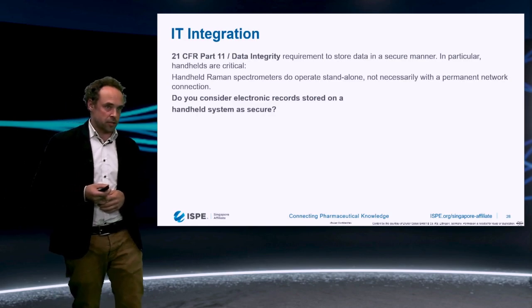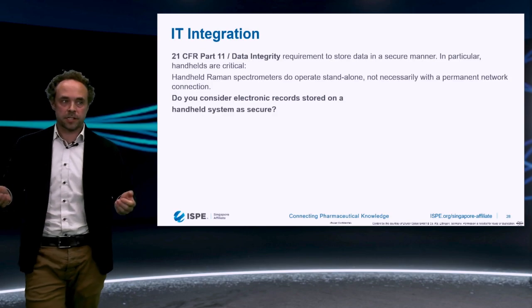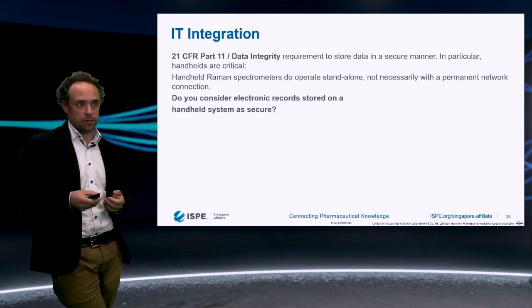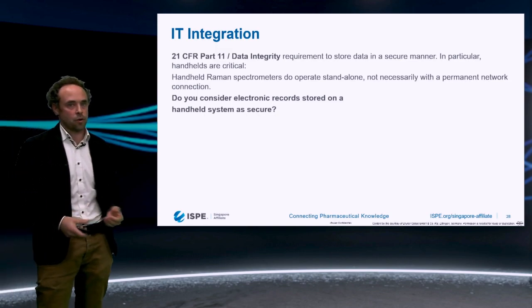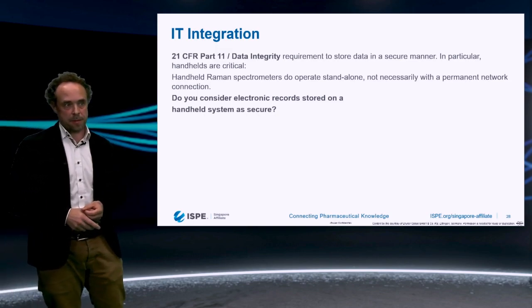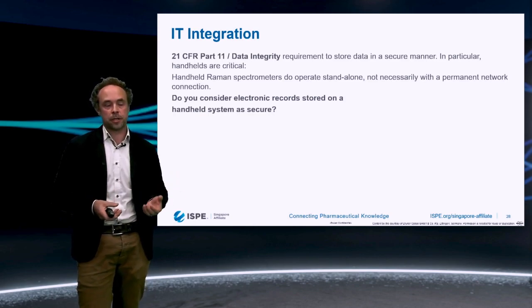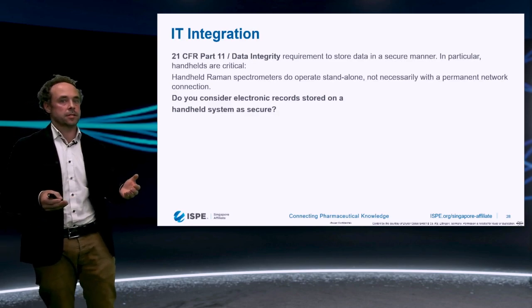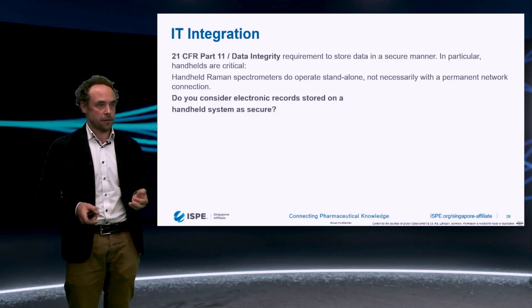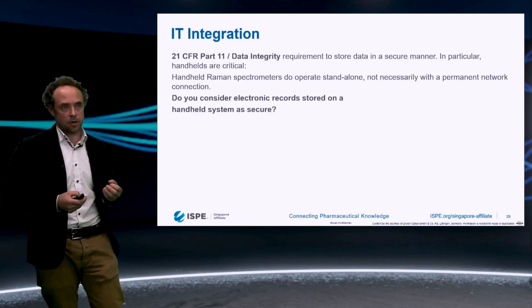A topic as well to address always is IT integration. An easy example, 21 CFR Part 11, data integrity, all these GMP regulations require to store data, of course, in a secure manner. And especially for handhelds, that's a critical point, because a handheld typically operates standalone, so not necessarily is it continuously integrated into a network, where we have, let's say, live data storage and backup.